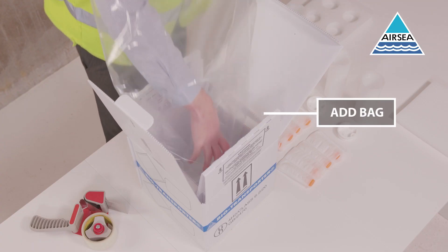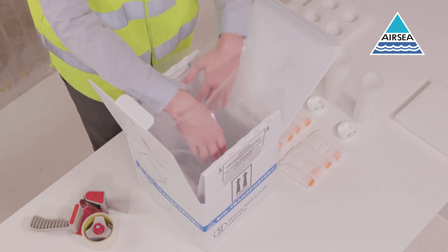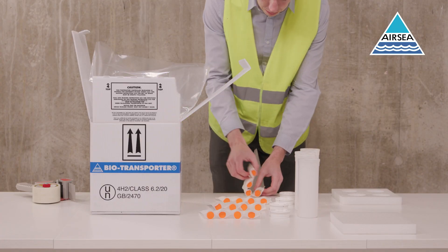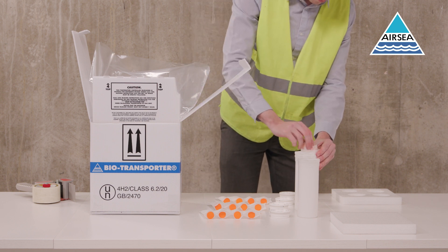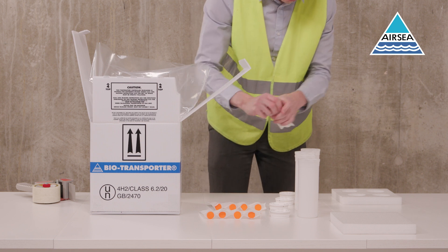Place the polythene bag into the box inside the buffer partitions. Wrap the primary receptacles in an absorbent and cushioning material. Add receptacles into the biotubes, securely sealing the lids.